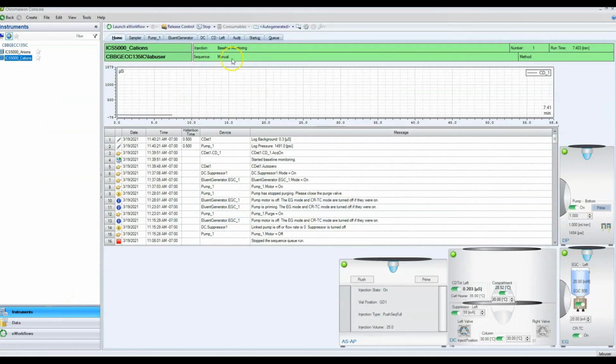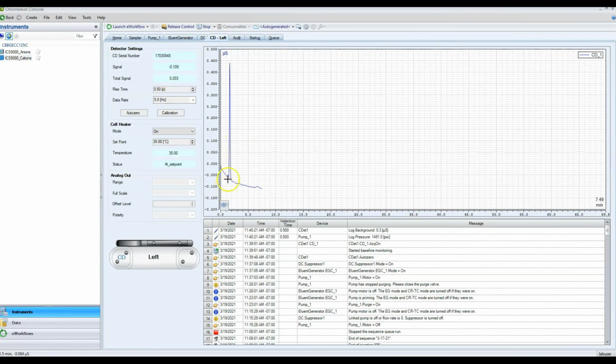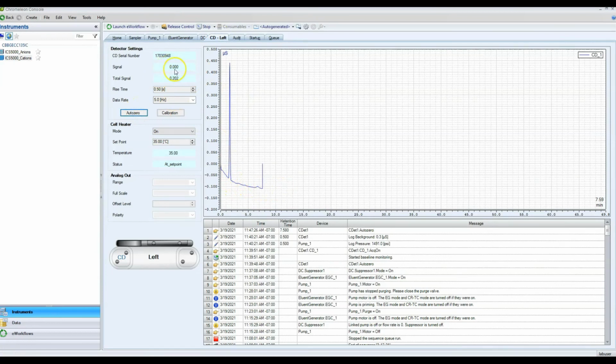So let's go back to our instrument. Let's see how our baseline is doing. If I auto size this, oh look, something came off of the column. You can see that it's starting to flatten out, right? So it's still changing a little bit. I'll auto zero it again to see if this is actually changing very much. Hey, there's another peak coming off. Something was in this when I stopped it.